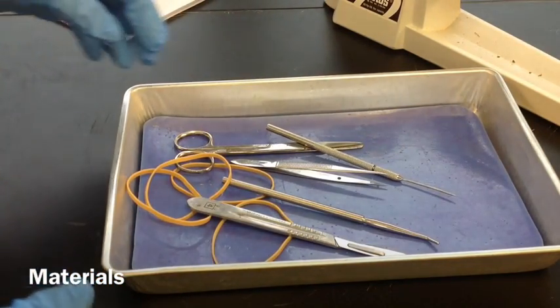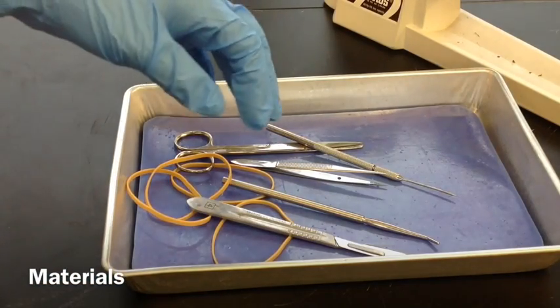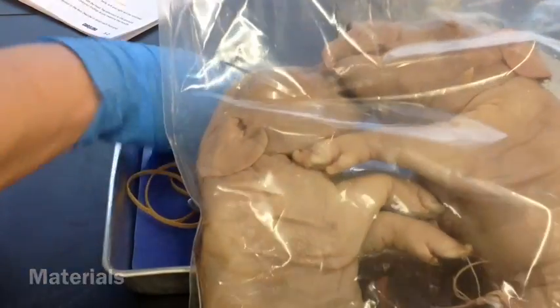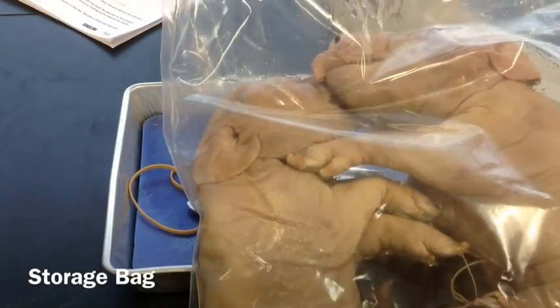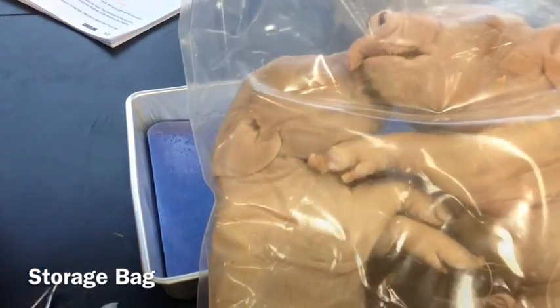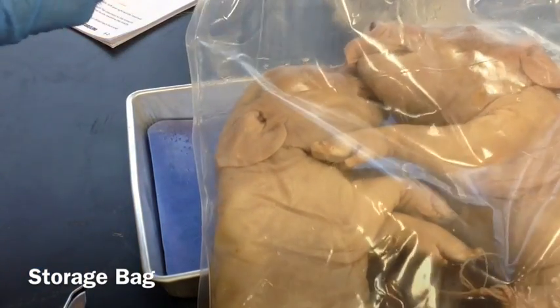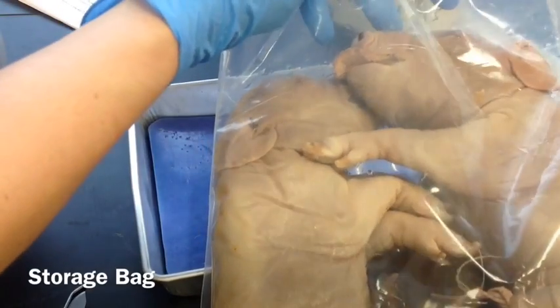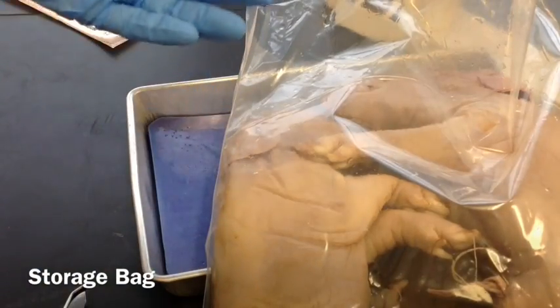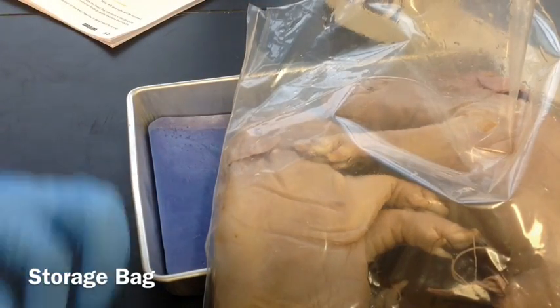The first thing you need to do is cut your pig out of your bag. There are two pigs to the bag, so your teacher may help you do this. You need to save the extra juices — the more juices you're able to save, the better, and the longer your pig will stay fresh.